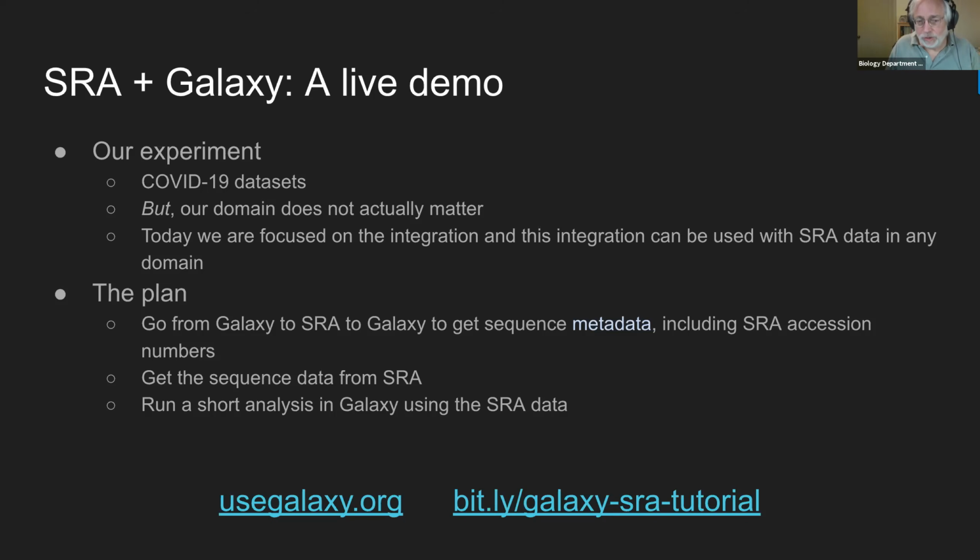Well, we're going to run a tool that goes back to SRA to grab the actual data itself. And then we're going to run a short, sweet analysis in Galaxy that uses the SRA data.